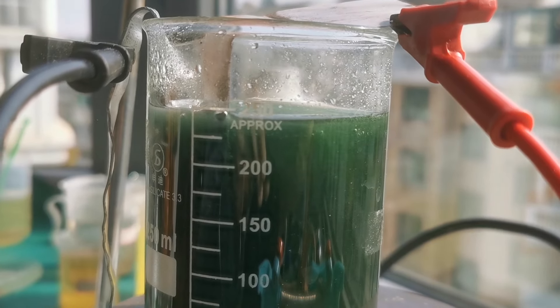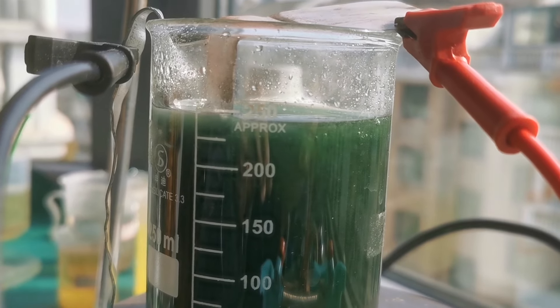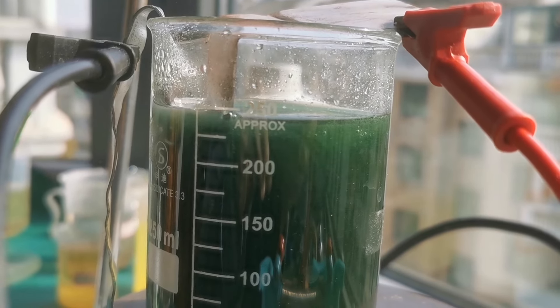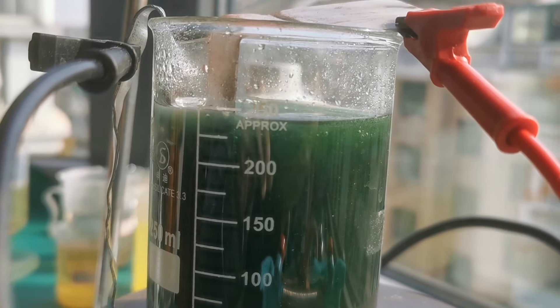This temperature is rather important to maintain, as higher temperatures would damage the nickel coating and lower temperatures would slow down the electrochemical reaction. Occasionally, I switched on the hot plate to maintain the solution at that temperature.